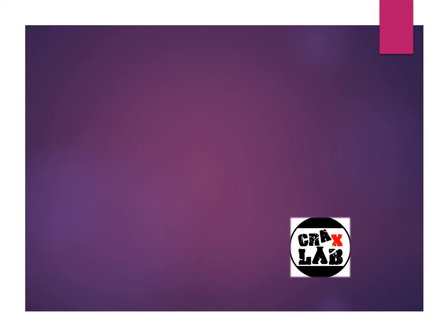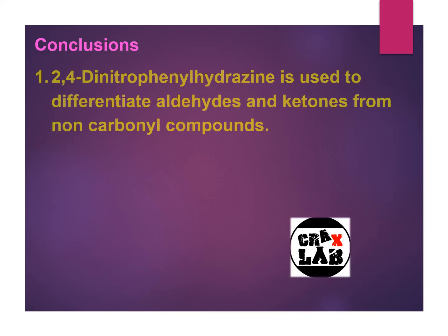And the final part is the conclusions. We can obtain three conclusions here. Number 1, 2,4-dinitrophenylhydrazine is used to differentiate aldehydes and ketones from non-carbonyl compounds.